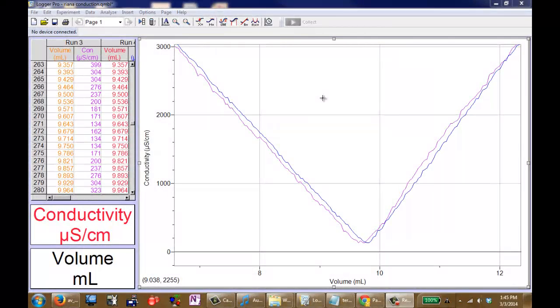Here you can see the data from the titration loaded into Logger Pro.